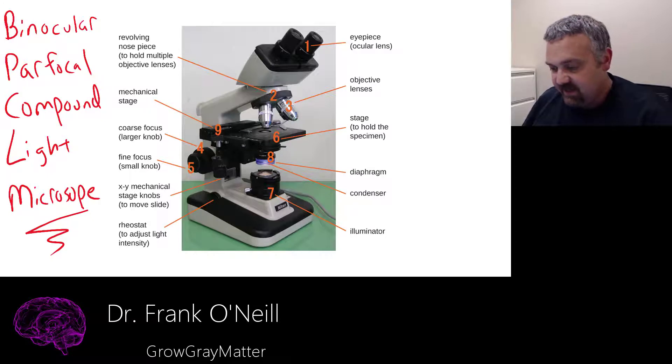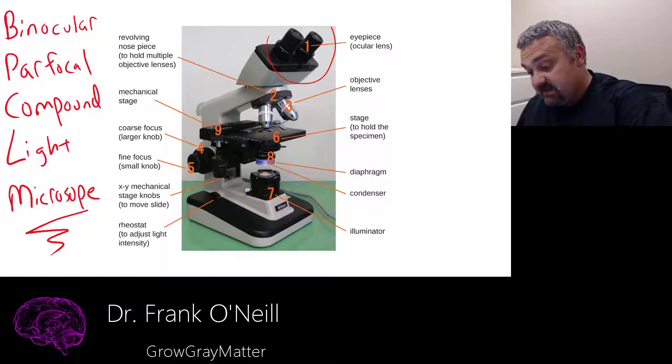This is, as I've written on the left-hand side here, a binocular parfocal compound light microscope. Binocular just tells us that we have the two eyepieces. Traditionally, microscopes only had a single one.